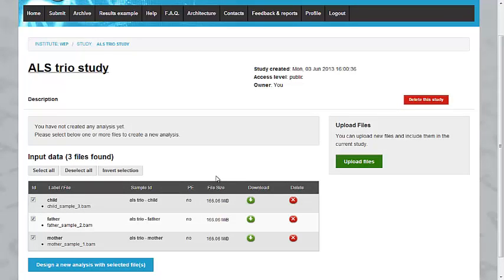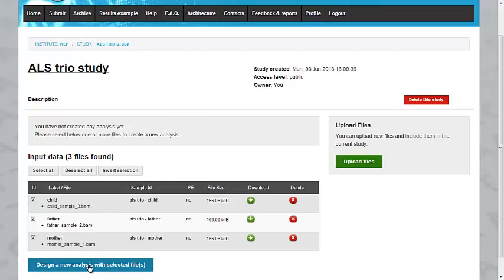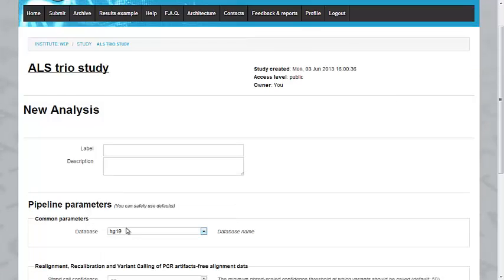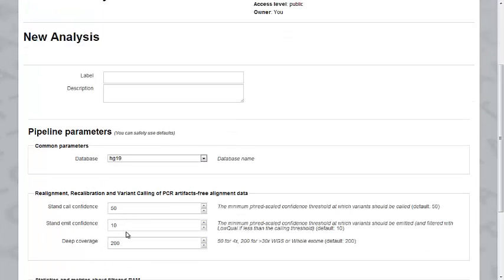The next step, if you want to start an analysis from these files, is to select the files that you want to analyze and click on the Design New Analysis button. You will be asked to label your analysis.